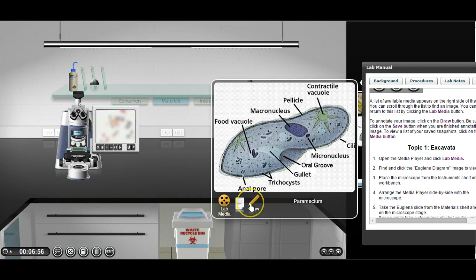If you have the sound on, you'll hear it kind of make a thoop and catch sound. Okay, that's way out of focus. So I'm going to turn the coarse focus adjustment, and it brings it into focus. Okay, now then, I want to get in a little closer.